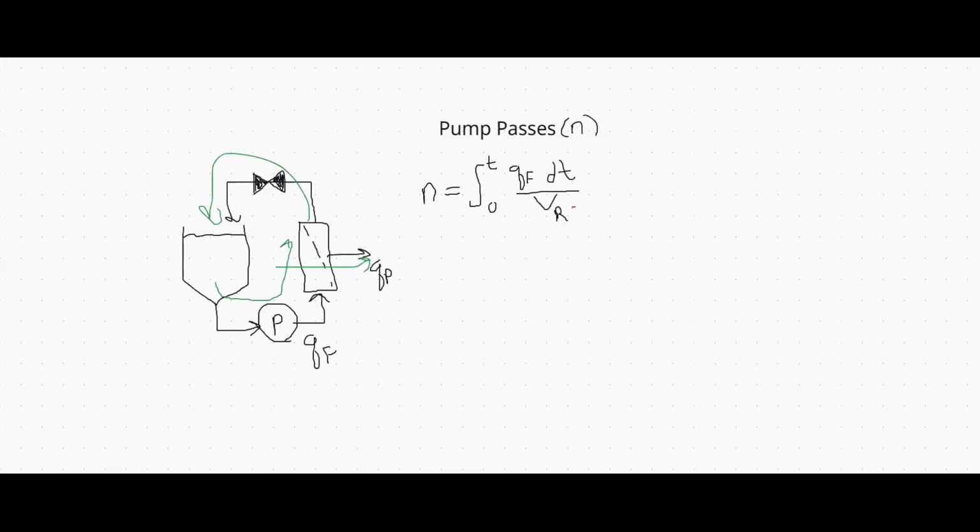So it's good to track your pump passes, especially during early development, so you can see what your product is capable of handling. The expression for pump passes is given here.